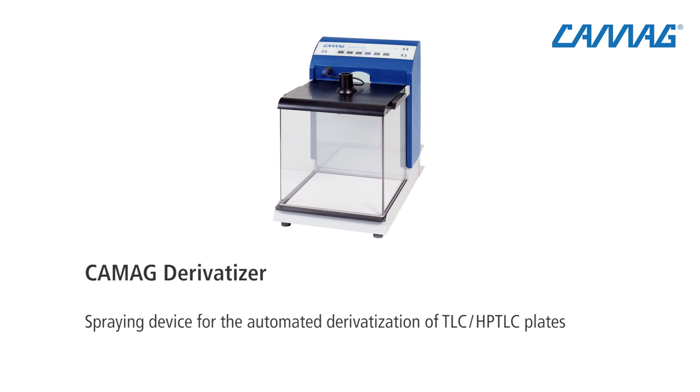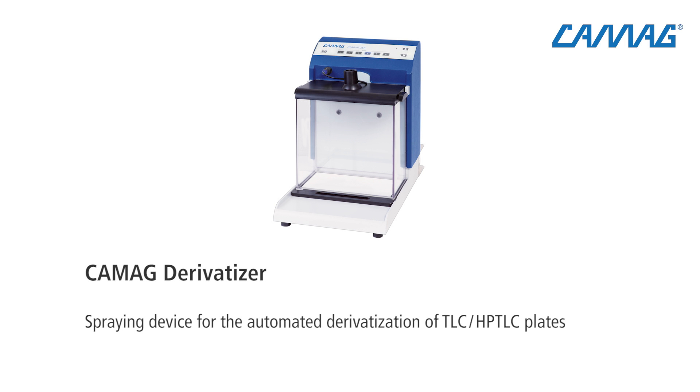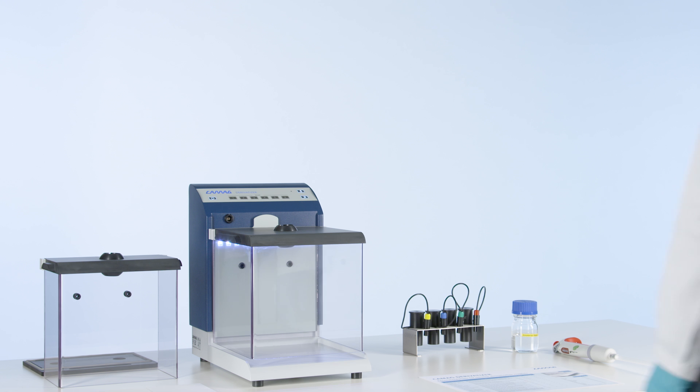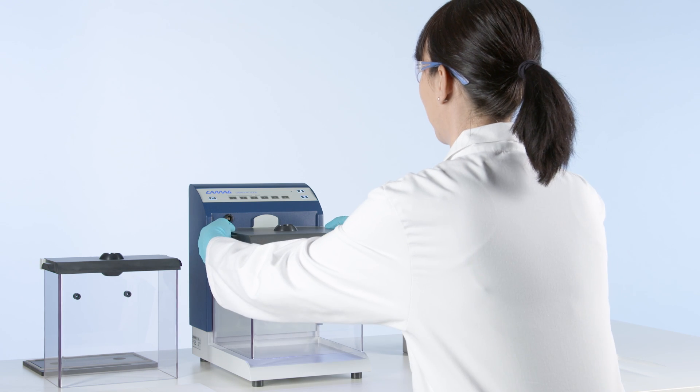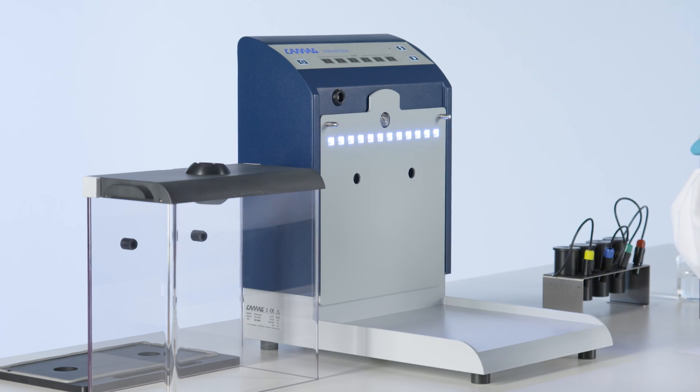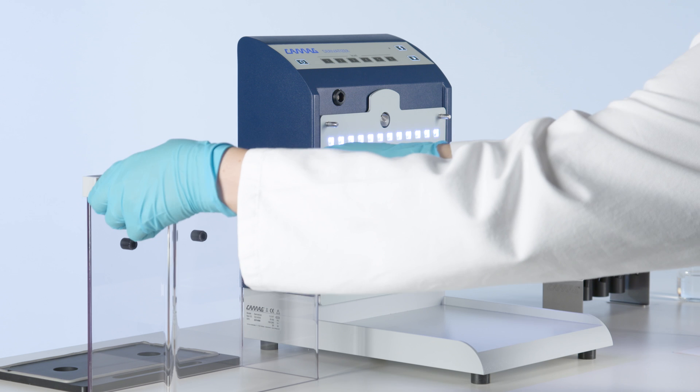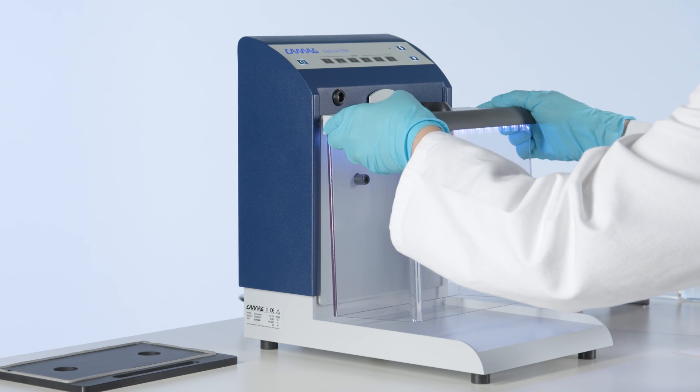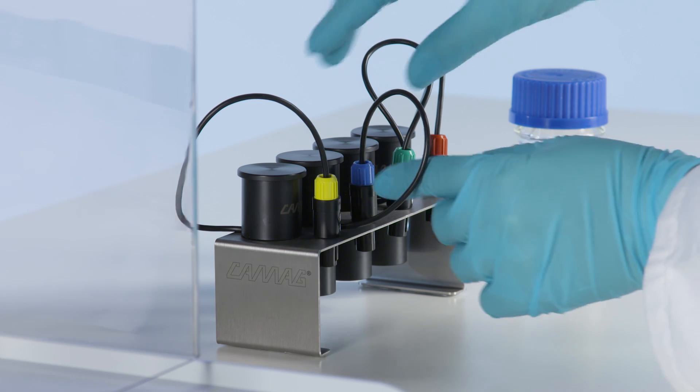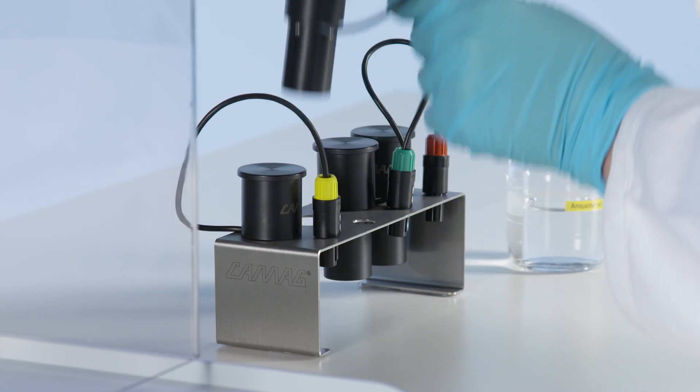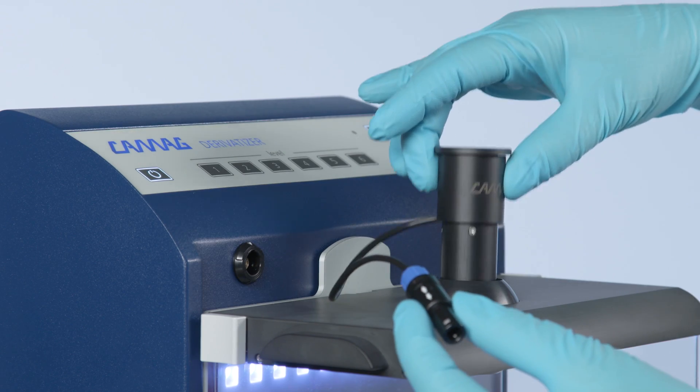The stand-alone unit is available for two different plate formats, 20x20 and 20x10 cm. Select the small hood for HPTLC plates and the appropriate nozzle. To meet the diverging physicochemical properties of the different reagents, four different color-coded spray nozzles are employed and the user can select from six spraying levels.